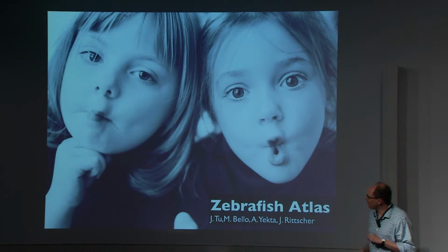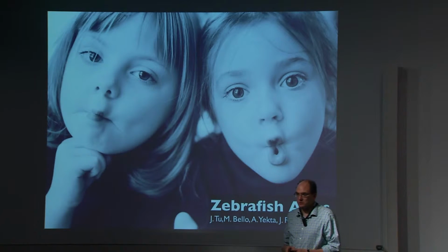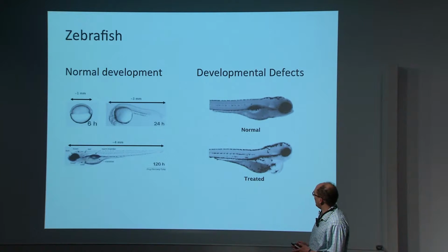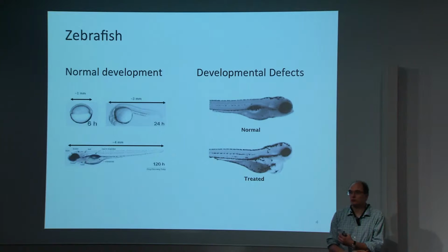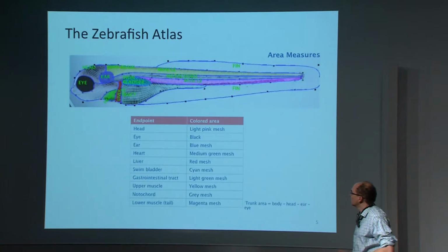So I'll give you an example out of the area of toxicology screening. The so-called zebrafish is a transparent model organism that transforms depending on certain toxicological states. And until recently, a lot of measurements had been taken by hand. And as you can imagine, if you want to screen thousands of compounds, you have to really worry about automation and automated data analysis.